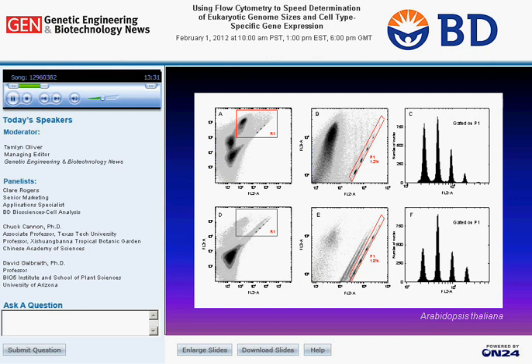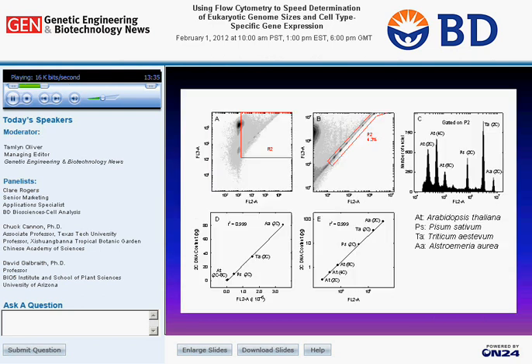So that was encouraging. So on the next slide, we then took the chopping procedure to all of the plant species that I previously mentioned. We chopped them up. We stained with propidium iodide ribonuclease. We, in panel A, measured the orange versus red fluorescence in a dot plot. We took region R2, which encompasses the region where the nuclei would fall, and we identified this line of correlation containing all the nuclear peaks. We put a P2 window around it.